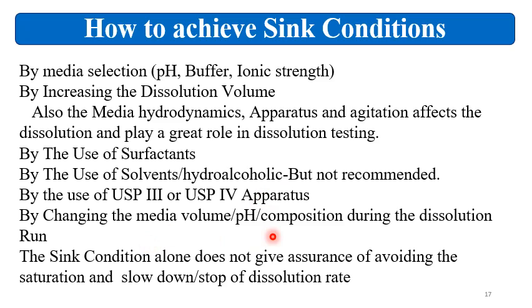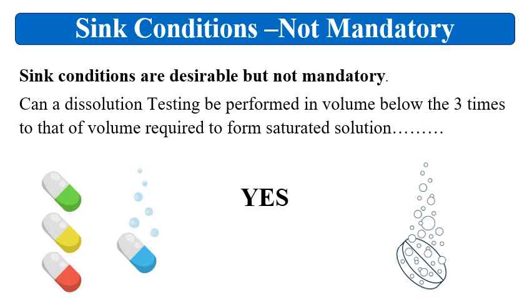Why? Because other conditions which impact the dissolution are media hydrodynamics, apparatus and agitation of the apparatus. See, till now we have discussed that the sink conditions are required. But if by any means you are not able to get the sink conditions, then can you perform the dissolution or can you develop a product? So yes, without sink condition also the product can be developed and it can be filed to the regulatory authorities.